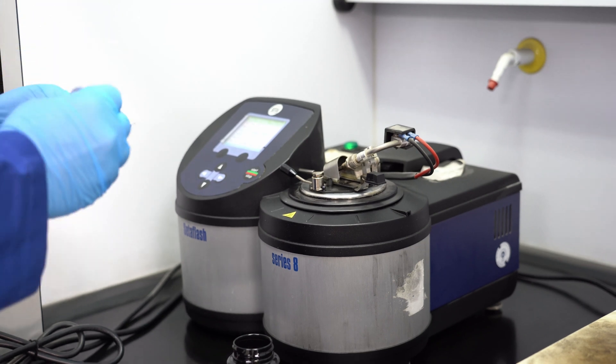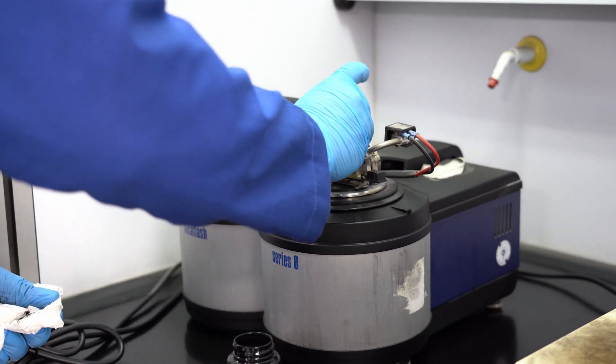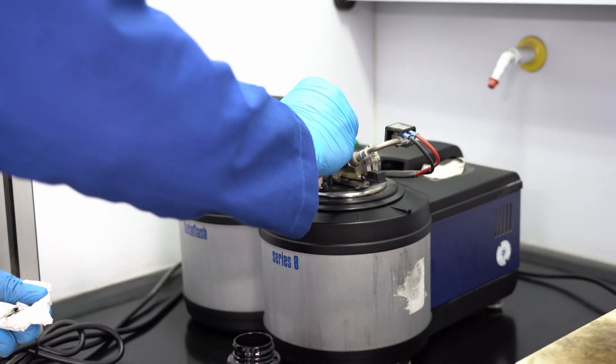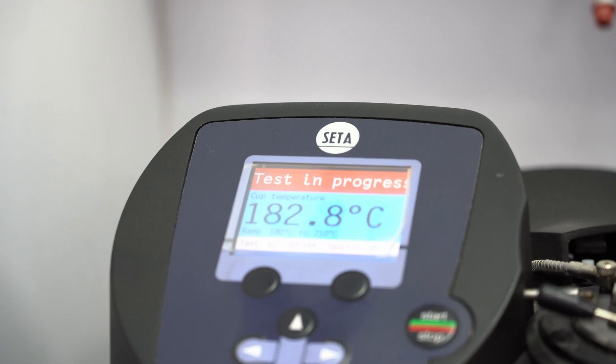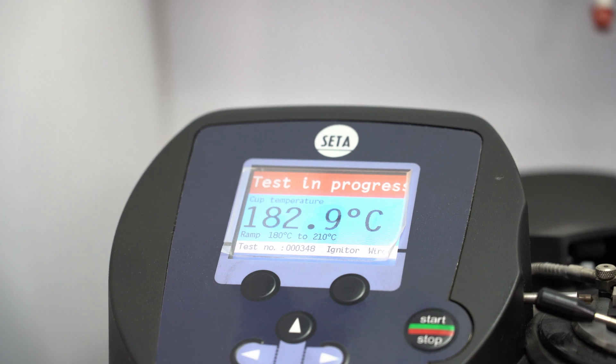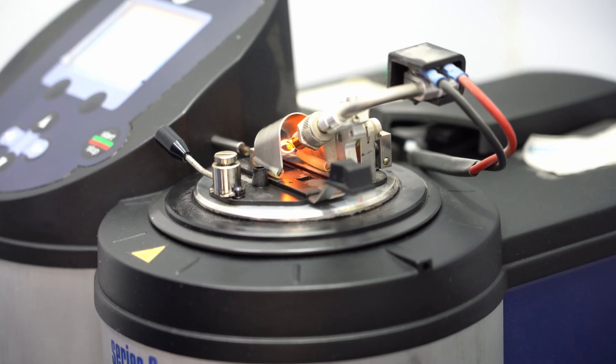In the rapid flash technique, a portion of the oil sample is heated in a closed cup for a short time interval. Diesel fuel vapors accumulate in the headspace of the cup during this time. At the end of the interval, a small flame is introduced into the headspace.